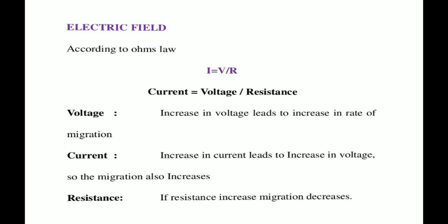So voltage is the potential energy of electrical supply which is stored in the form of an electrical charge. Then the second thing is current. Okay, so current is generated due to the potential difference applied between the electrodes. मग हा करंट कधी जनरेट होतो आणि का जनरेट होतं, ठीक आहे.